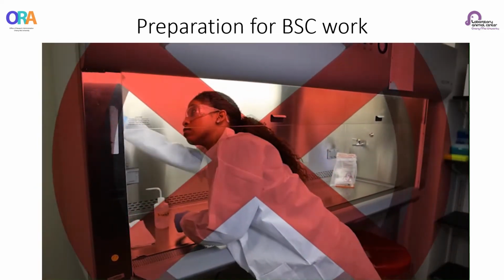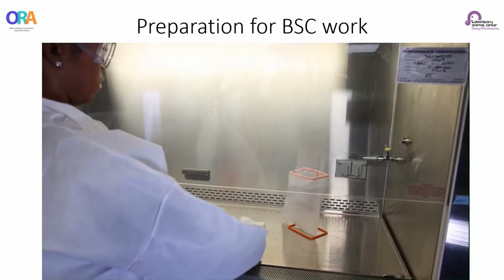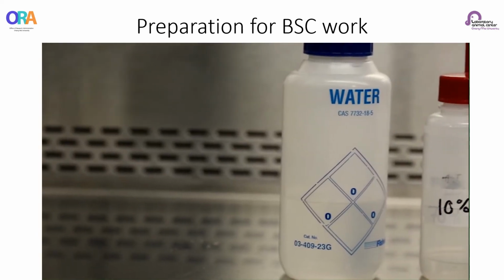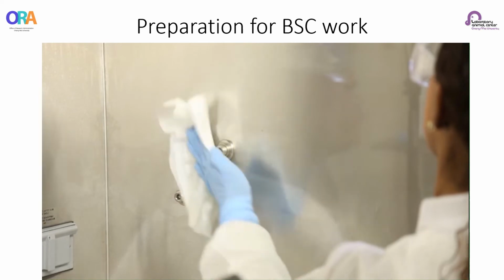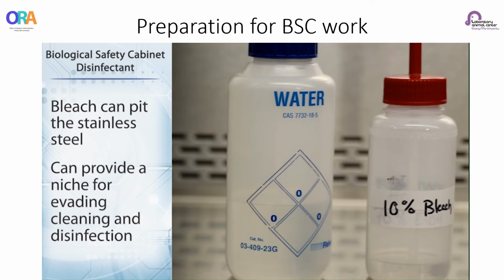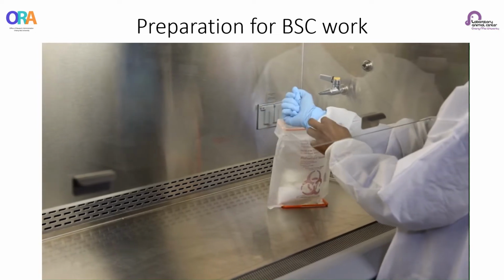Don't ever put your head inside a BSC. If you can't reach the back wall, use an extendable mop and then discard the used disposable mop cloth into the biohazardous waste container. If bleach has been used as a disinfectant, wipe the BSC surfaces again with water or 70% ethanol to remove any bleach residue. This is because bleach is corrosive and can pit the stainless steel, which can provide an ecological niche or environment for microorganisms to evade cleaning and disinfection. Once you have completed disinfection of the BSC, dispose of your gloves in the biohazard waste container.